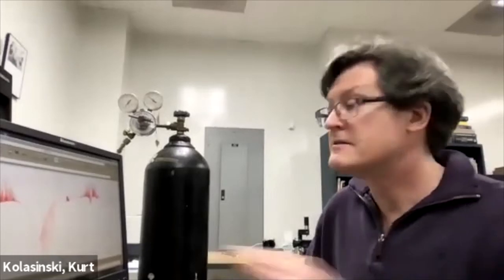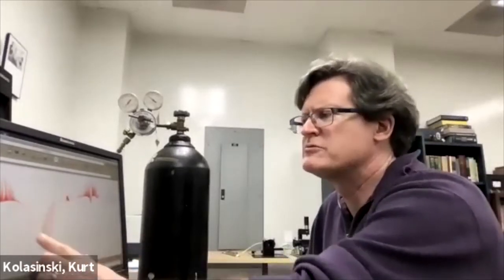In the range that you're going to look at, you can see the HCl part of the spectrum. We'll do a better background. Since we had the cell out, we didn't get a nice flat background. But for the high resolution scans we're going to do, we're going to make sure that we get a nice flat background.